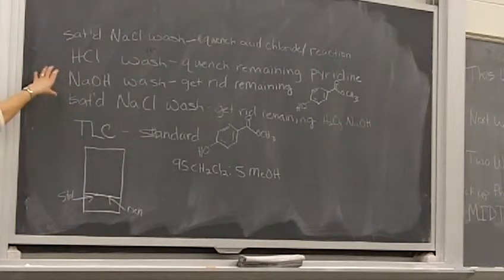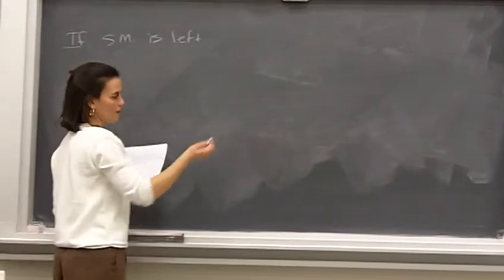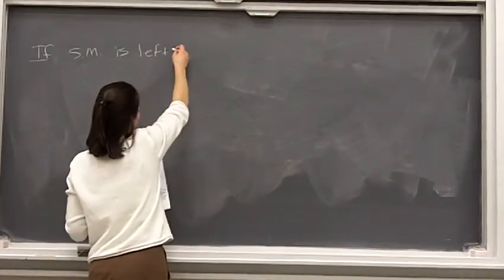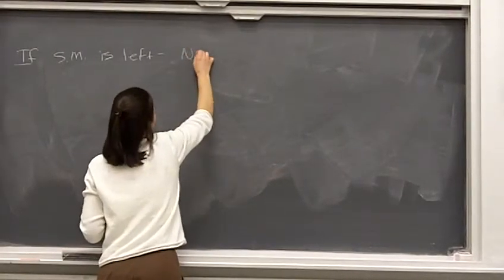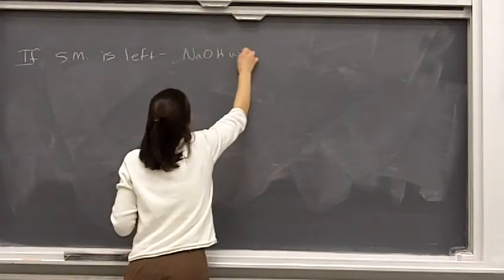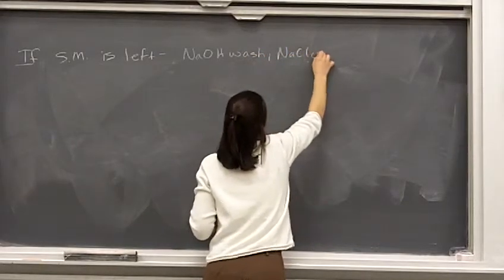So if you have starting material left, you probably will want to double check with your lab instructor to see if it's worth doing all these washes, but if you're seeing it by TLC, then you're going to do the NaOH wash again, and the sodium chloride wash again, okay?